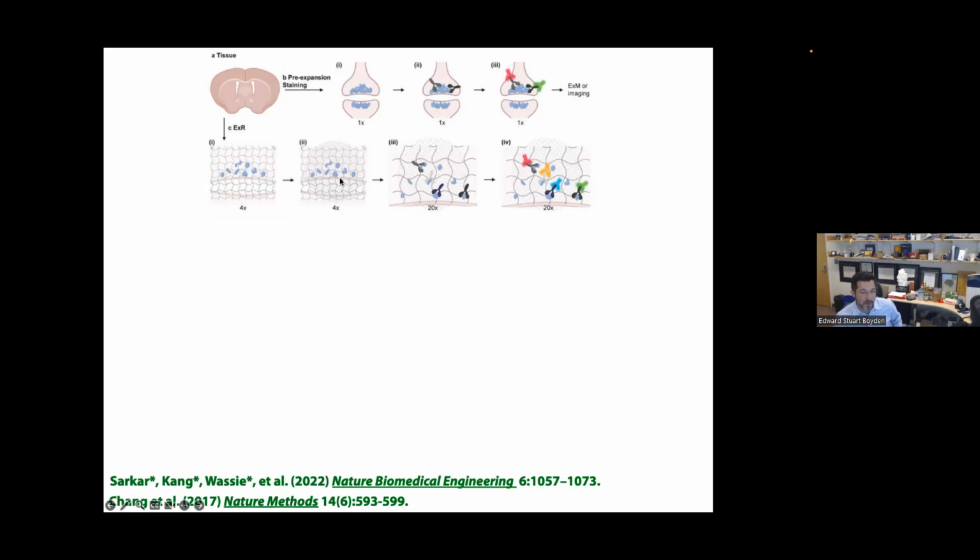So we can take a specimen, polymerize and expand it, form a second polymer in the space opened up by the first expansion, and expand it a second time. This is a version we call expansion revealing, because it illustrates a second benefit of expansion. Expansion democratizes nanoimaging, but it also pulls things apart from each other. Labels, of course, have to bind their targets in order for light microscopy to work. Maybe by expanding things away from each other, we could get better labeling?